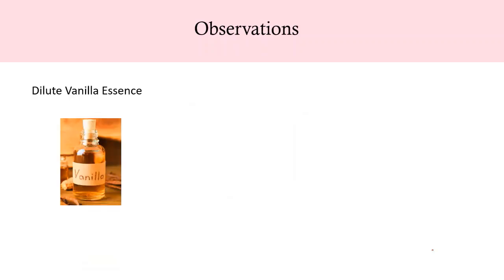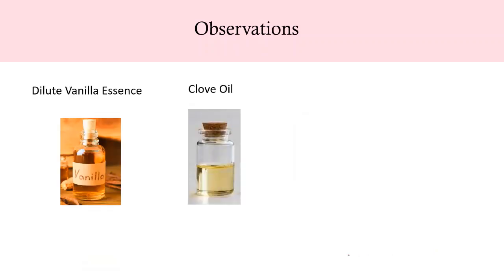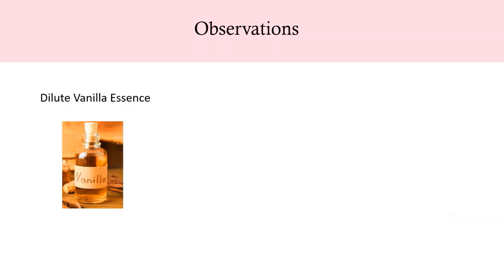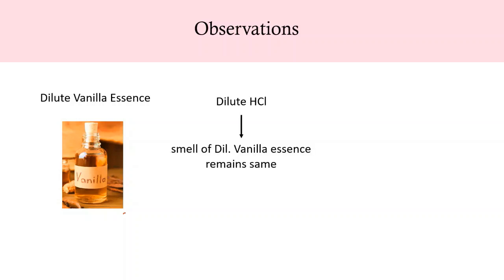Next we take the other two olfactory indicators — dilute vanilla essence and clove oil — and also take dilute hydrochloric acid in one test tube and dilute sodium hydroxide in another. Now add a few drops of dilute vanilla essence to dilute hydrochloric acid and shake the test tube. We observe the smell of dilute vanilla essence remains the same, and we conclude that its smell remains the same in acidic medium.